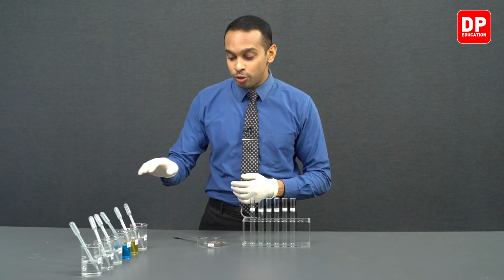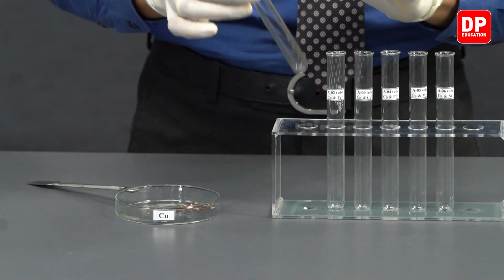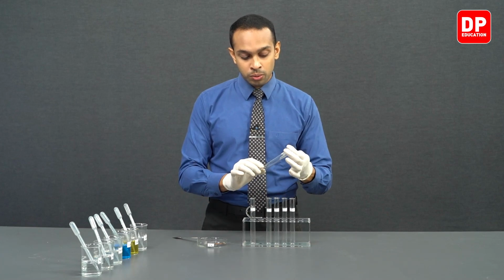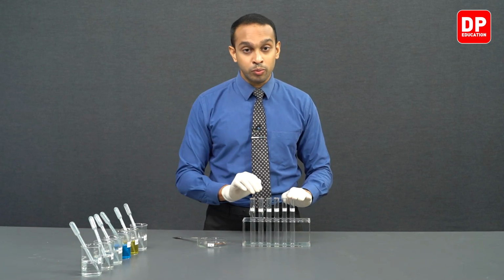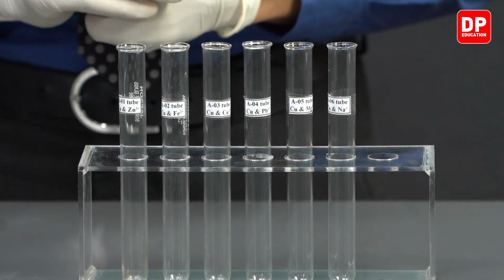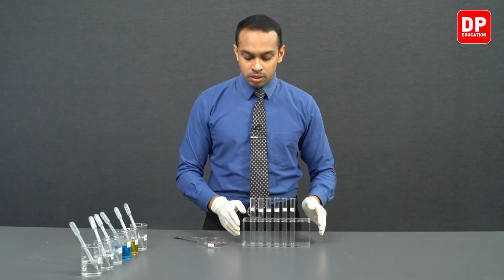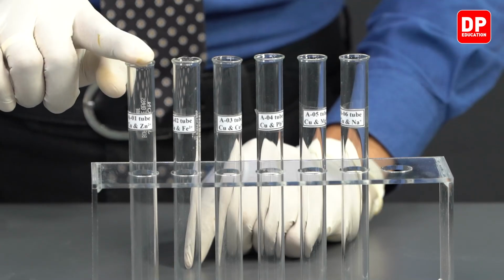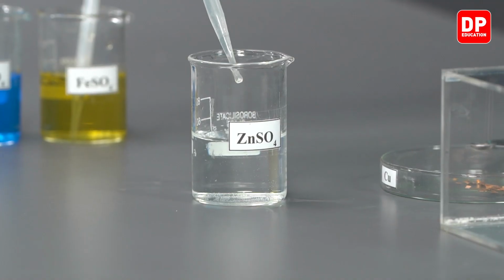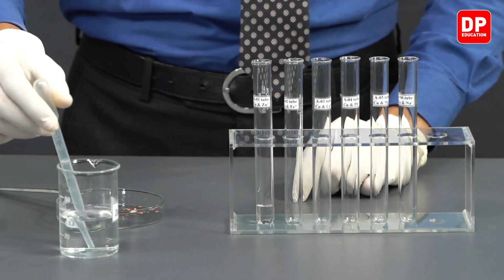So in order to do that, we are going to first of all withdraw around 5 milliliters of each of these solutions into these test tubes. These test tubes are labeled ranging from zinc 2+ ion solutions all the way to our sodium 1+ ion solutions over here, right? So they are properly labeled. So first of all, we are going to take 5 milliliters of these solutions into each of these test tubes. So to the test tube labeled zinc 2+ ions, we are going to take around 5 milliliters of zinc sulfate solution.